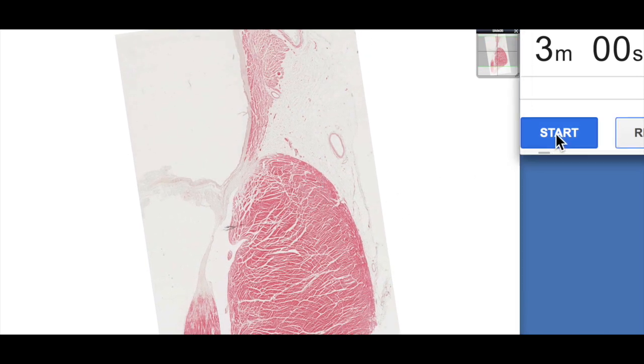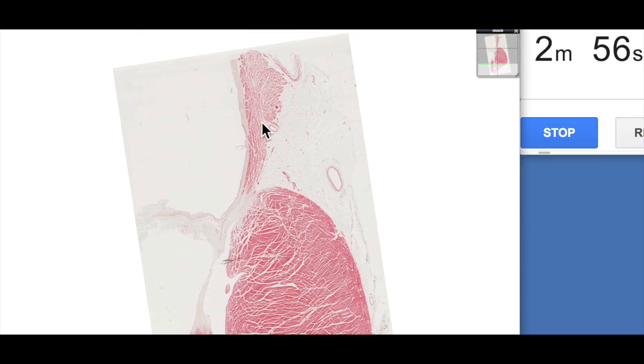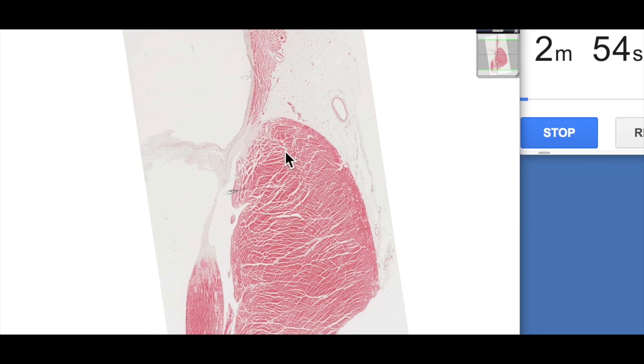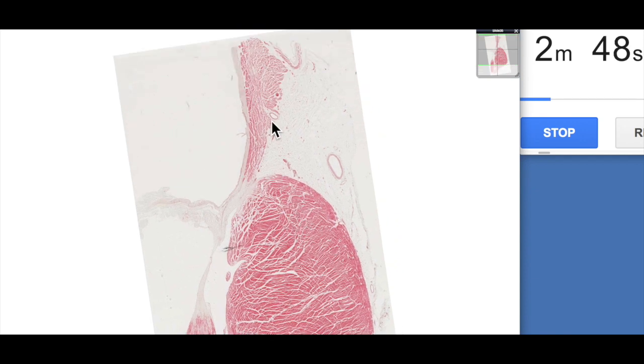So let's start our timer. Okay, so as I mentioned this is a junction between the atrium superiorly and then the ventricle inferiorly and you can certainly see one of the major differences between the atrium and the ventricles of course that's the size of the chamber.